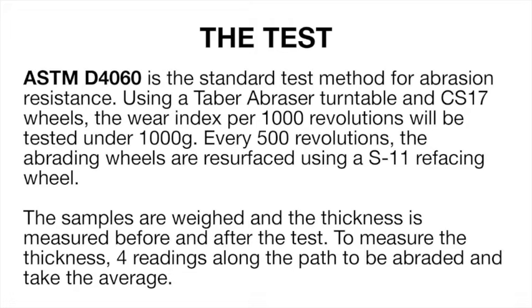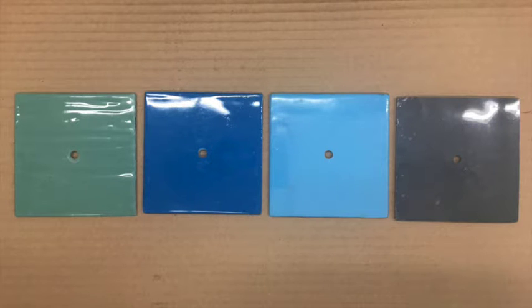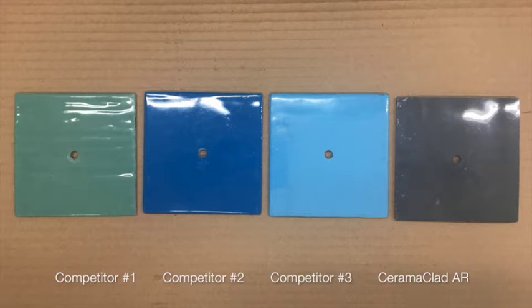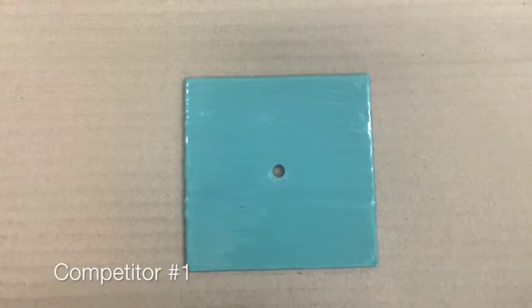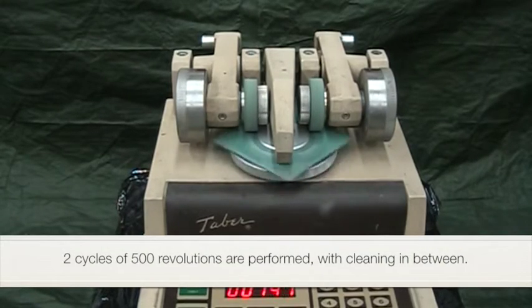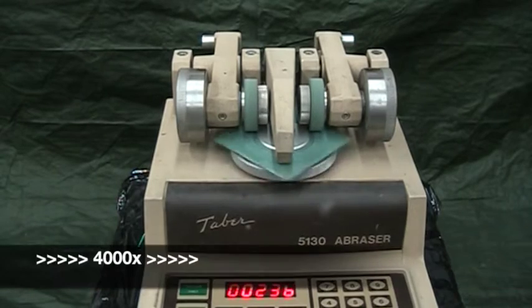Every 500 revolutions the abrading wheels are resurfaced using the S11 refacing wheel. The samples are weighed and the thickness is measured before and after the test. To measure the thickness, four readings along the path to be abraded are taken and the average measurement is recorded.